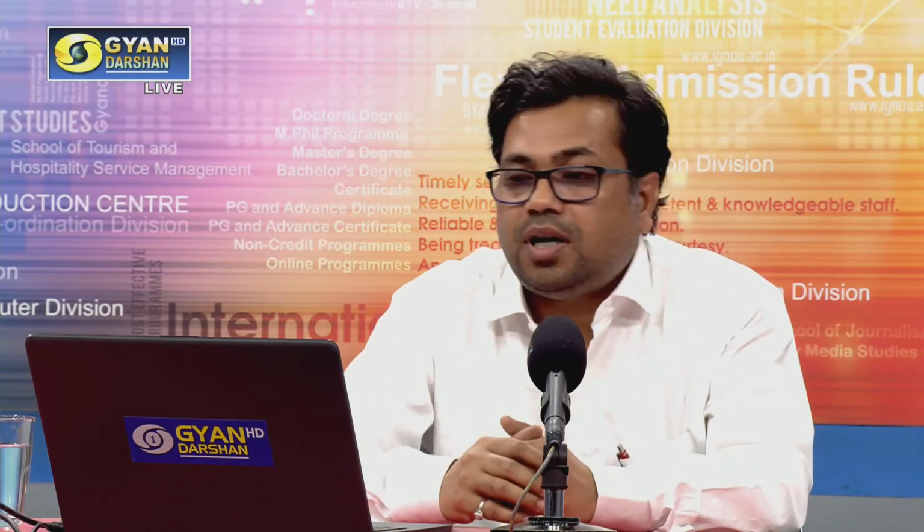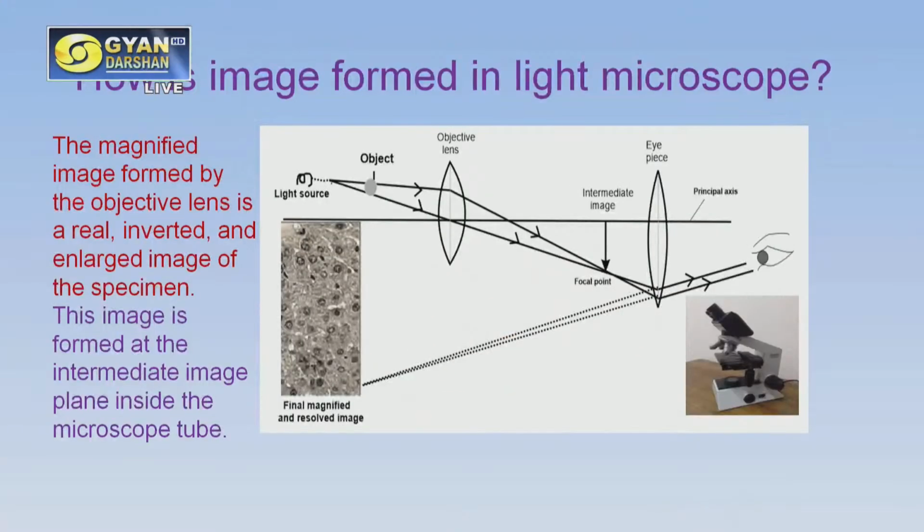So here we have to remember that the biological specimen is very thin when we prepare the biological slide. Next, a question can arise in our mind: how is the image formed in a light microscope? You can see here the light source, the objective lens and the eyepiece. The magnified image is first formed by the objective lens, and the image of the biological specimen that we see is real, inverted, and enlarged.